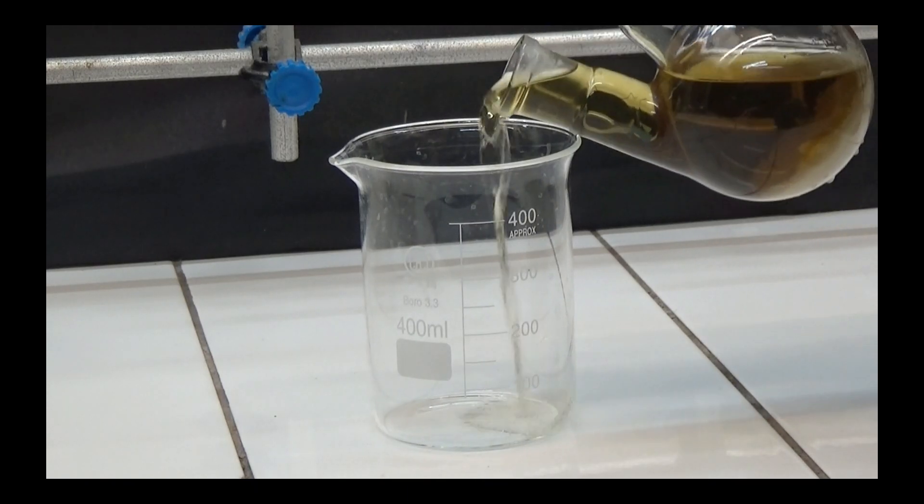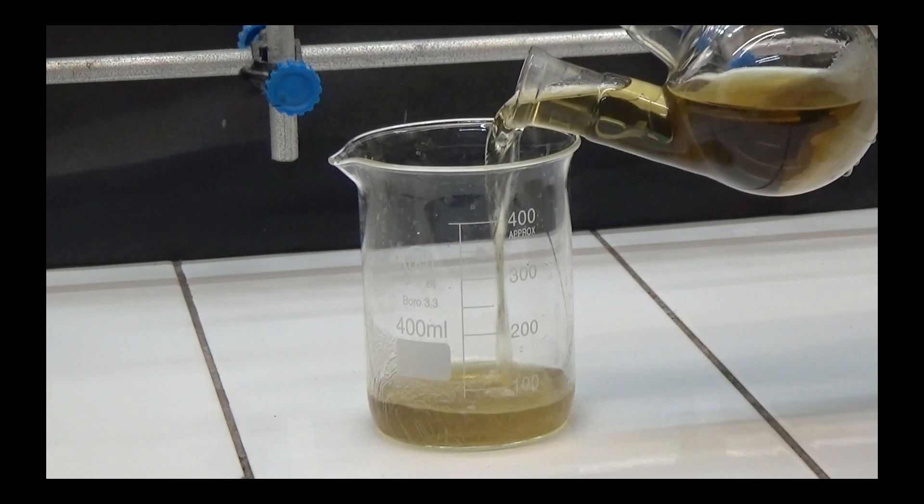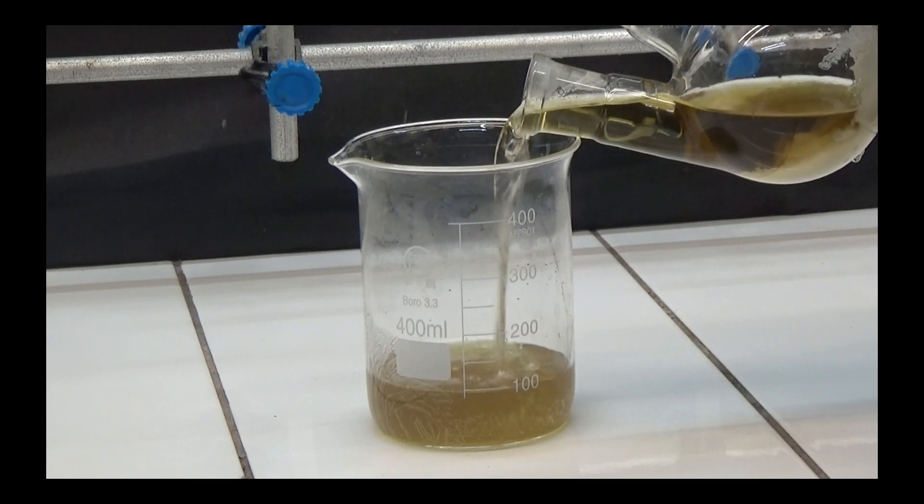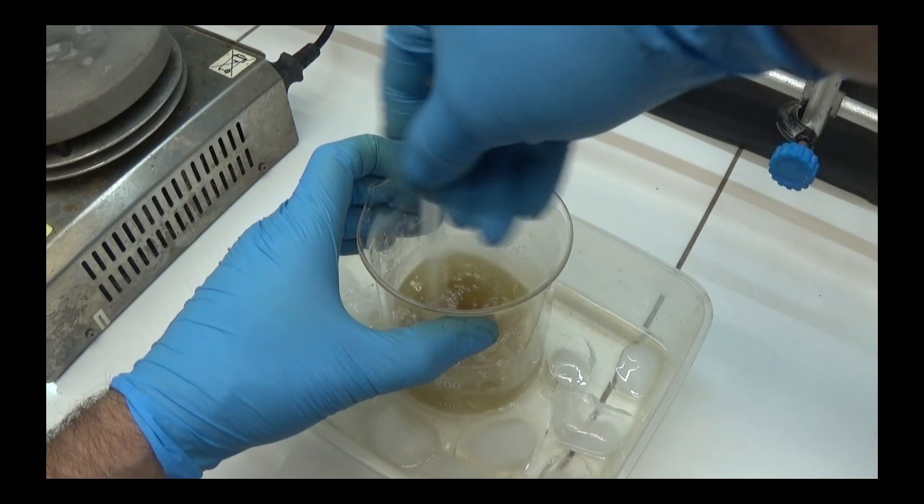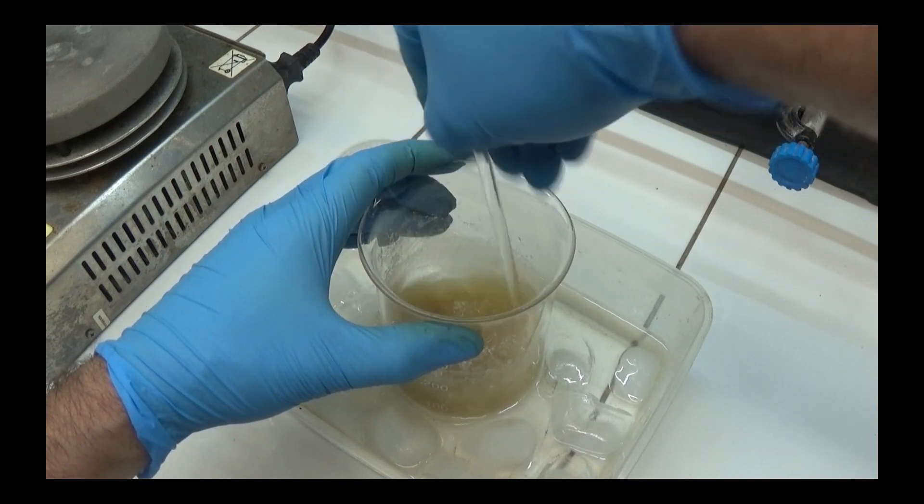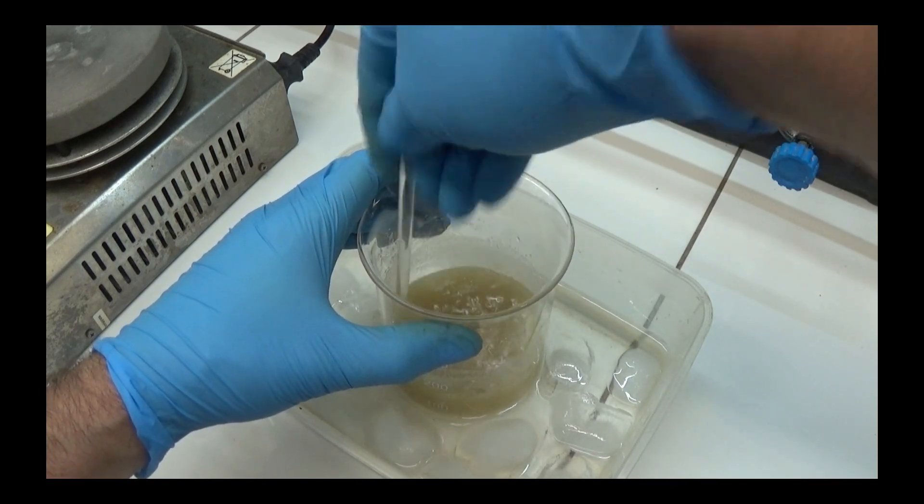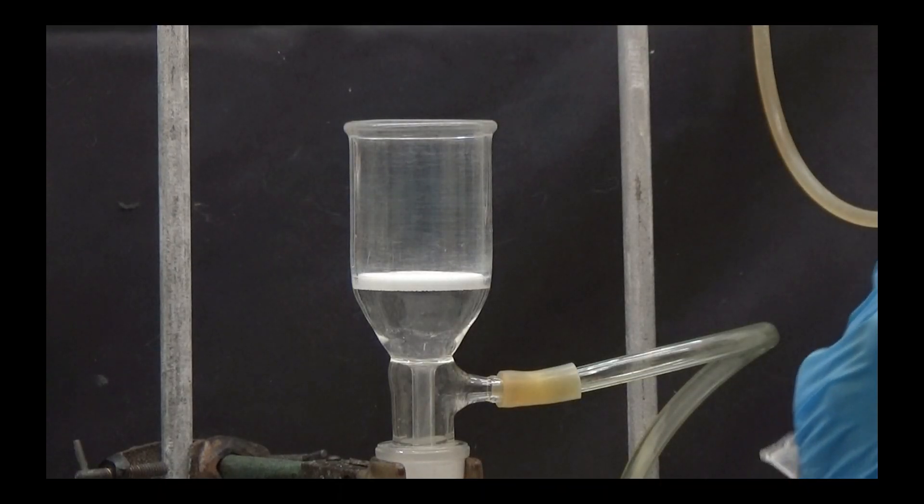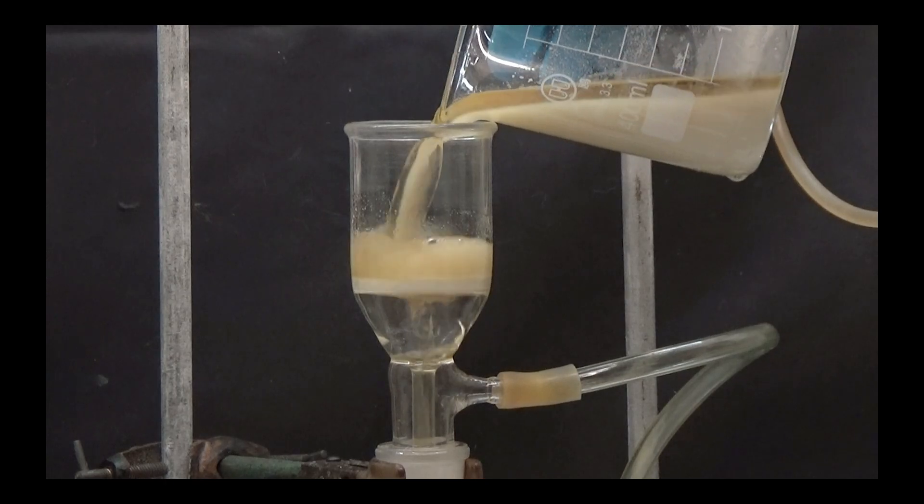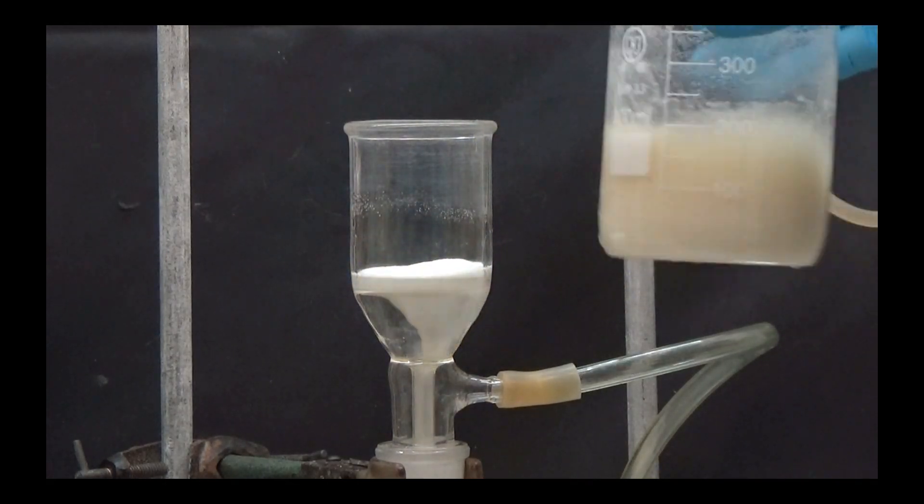Pour the hot content into a beaker and cool it with an ice water bath to promote crystallization. To accelerate crystallization, we scrape the walls of the beaker with a glass rod. Collect the crystallized succinimide by suction and wash it with 30ml of cold acetone.